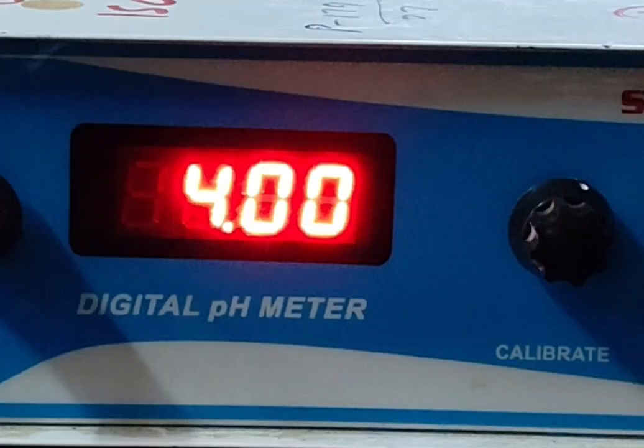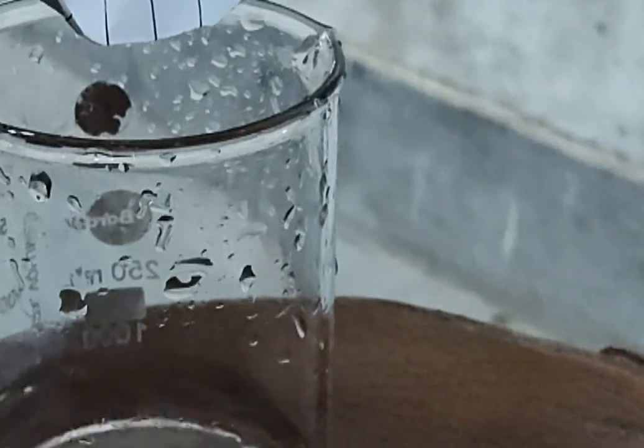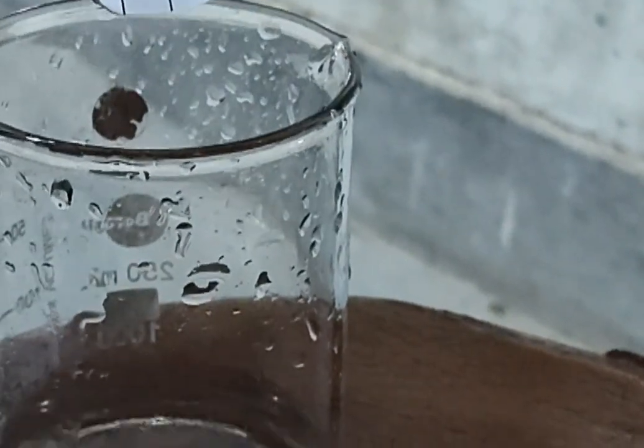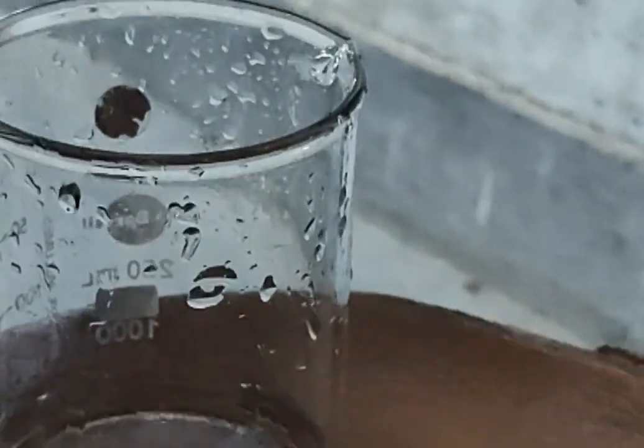Now after mixing, we have achieved our buffer solution of sodium acetate and acetic acid. Now we are using a pH meter. We are calculating its pH. The pH has come out to be 4.